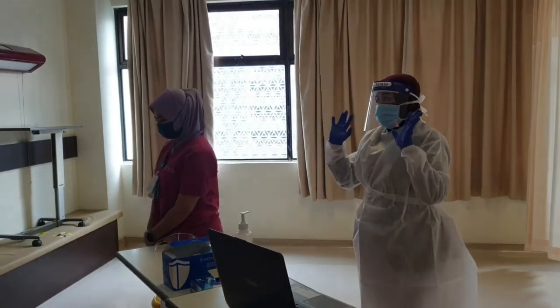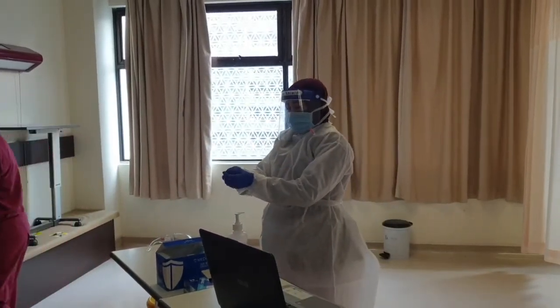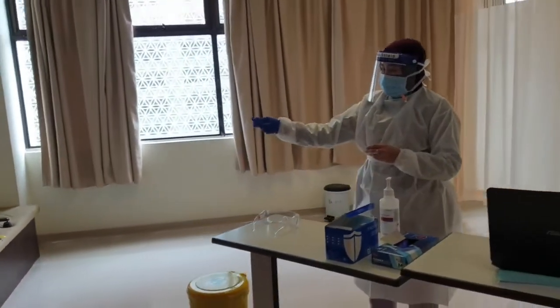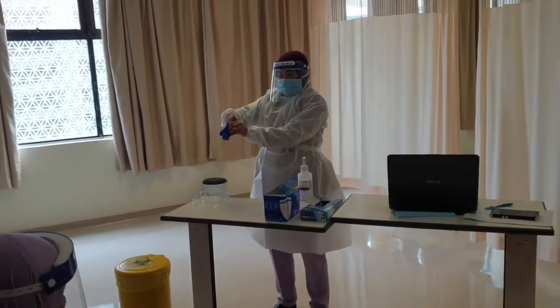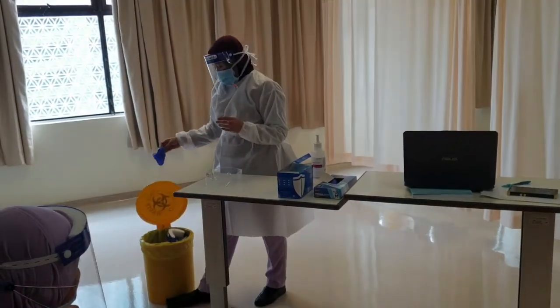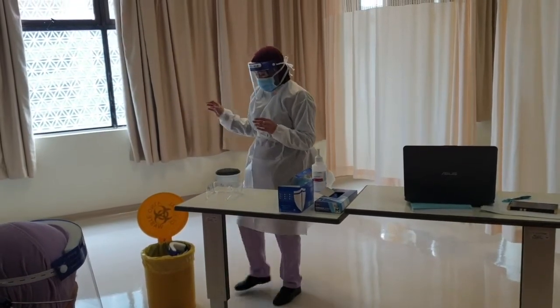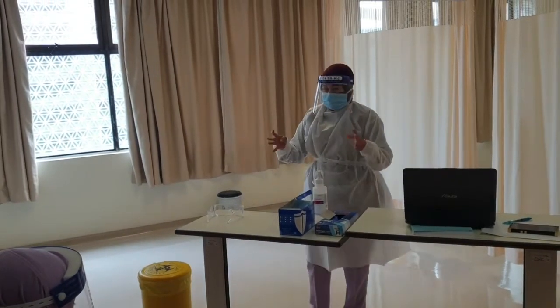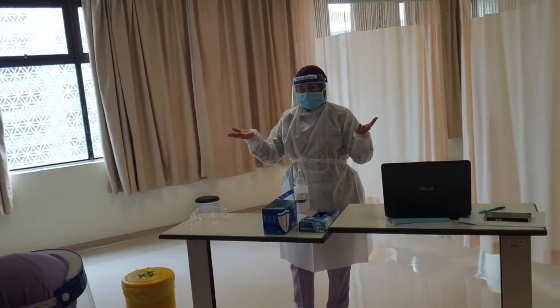So now for the doffing. Make sure you don't touch. This is a dustbin or container that we need to have. After that, what do you need to do? Remove the gown.